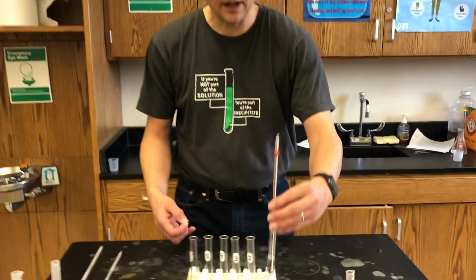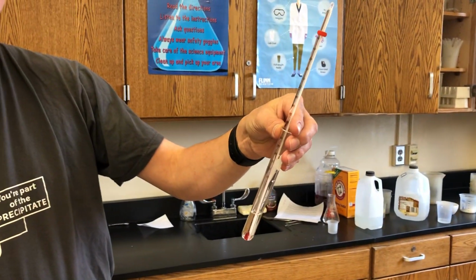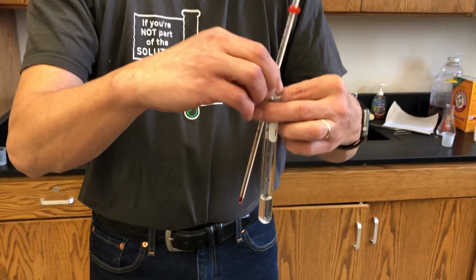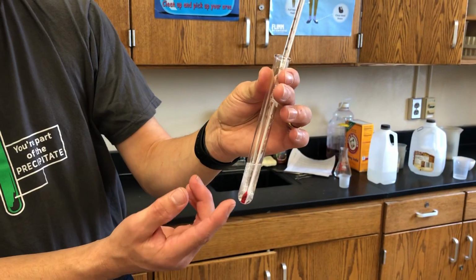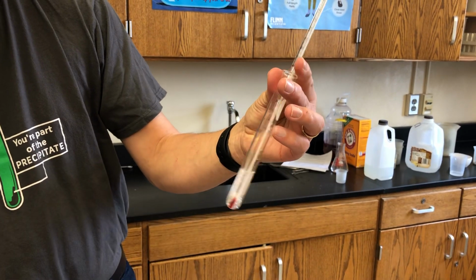So, I've had my thermometer in the hydrochloric acid and my starting temperature is 21 degrees Celsius. I'm going to take the thermometer out, put the pieces of zinc in, put the thermometer back in, and I'm going to watch both the thermometer and what's happening in this. Now I want to watch the thermometer for the greatest amount of change.